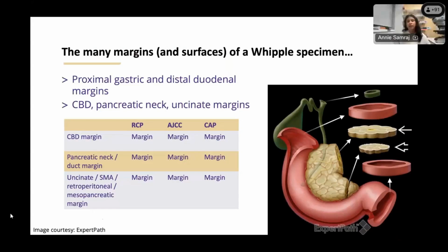So, as in all of pathology, really, we are catering to the patient and the surgical colleagues. So it's a good idea to understand what information they need. So I'll tell you about my experience. At the University of Washington and predominantly in North America, we follow the CAP guidelines.